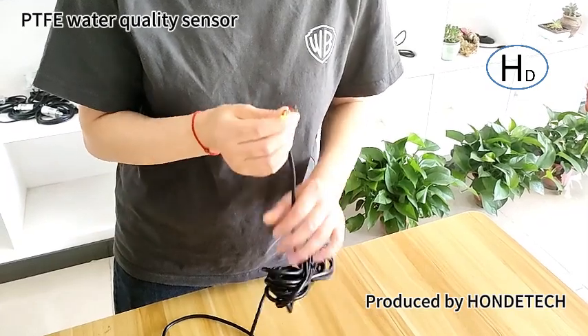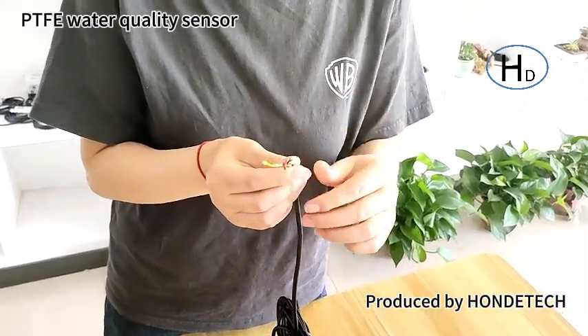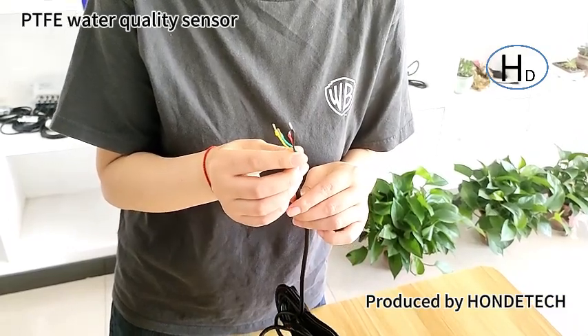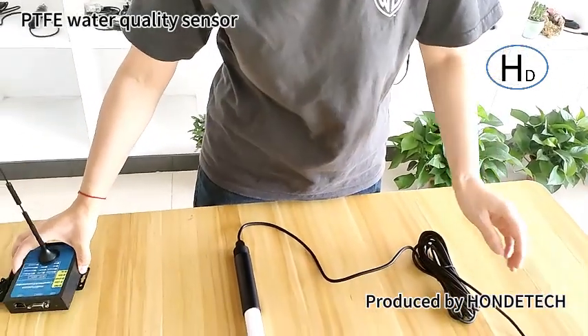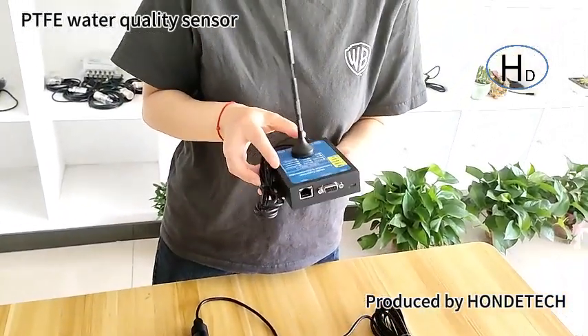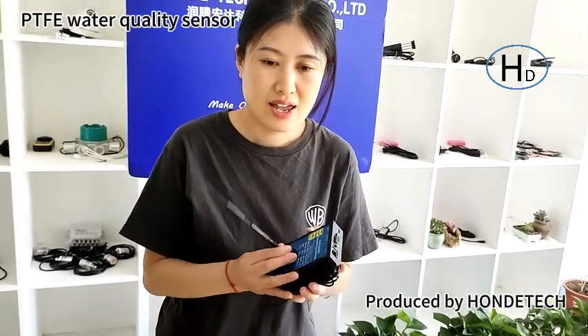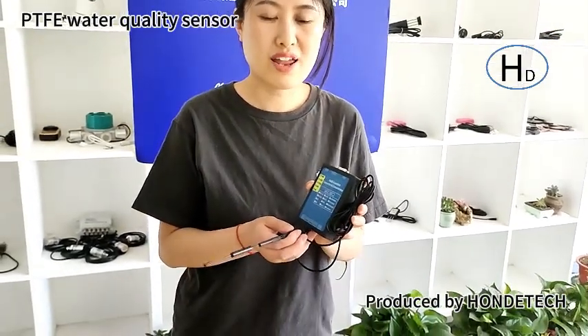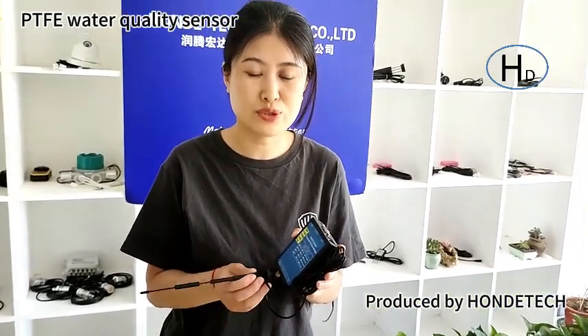The output is RS485 or 4-20mA output. We can supply all kinds of wireless modules including GPRS, 4G, Wi-Fi, and LoRa. We also can offer software so you can check the parameters on your computer. Thank you.